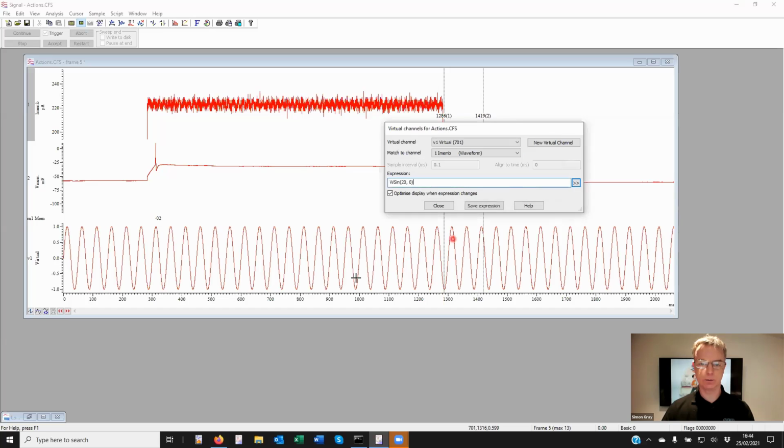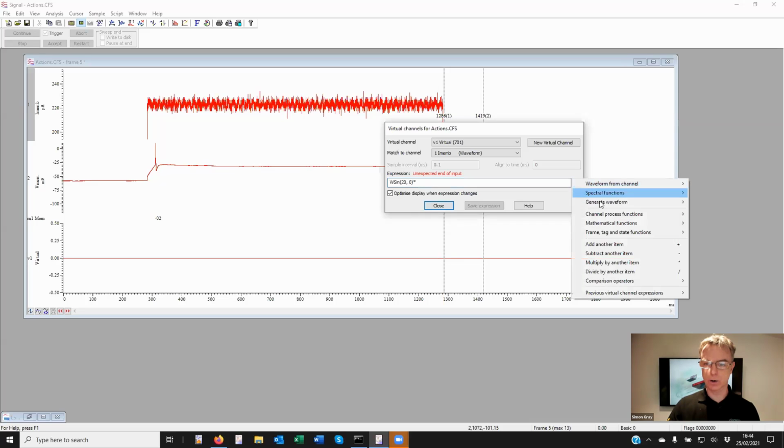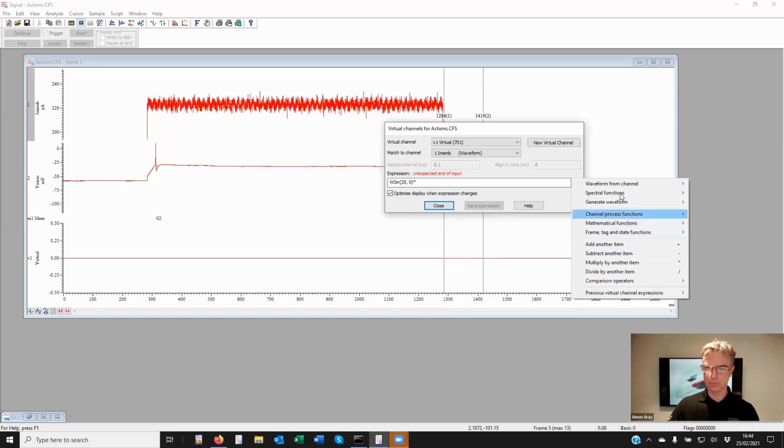Like that. So then you have a waveform which you could subsequently use as an output if you wanted to stimulate. Now, obviously, sine waves you can generate in the pulse dialog anyway, but you can do other things with this. You can then apply an envelope to it.